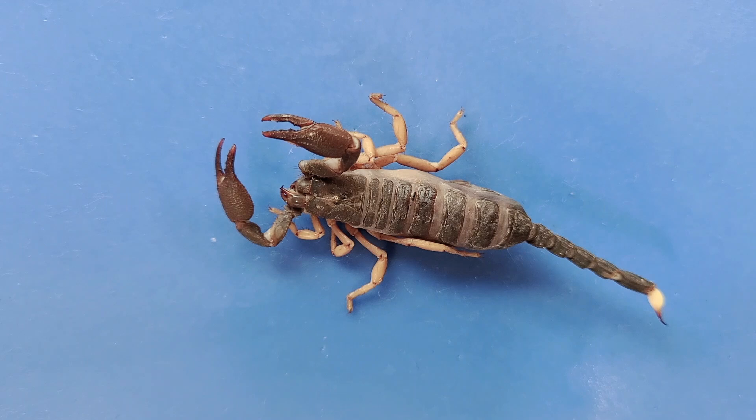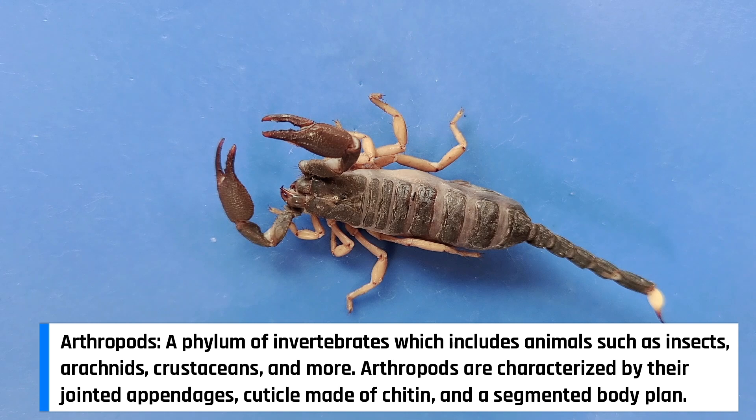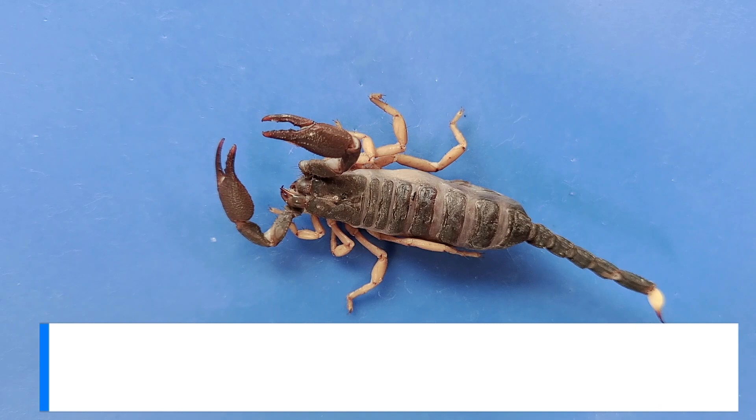The first thing you might notice are these large claws, which lobsters and crabs also have. Scorpions are related to lobsters and crabs — they're all part of the phylum Arthropoda. However, scorpions are actually even more closely related to spiders. Both are part of the subgroup Arachnida.